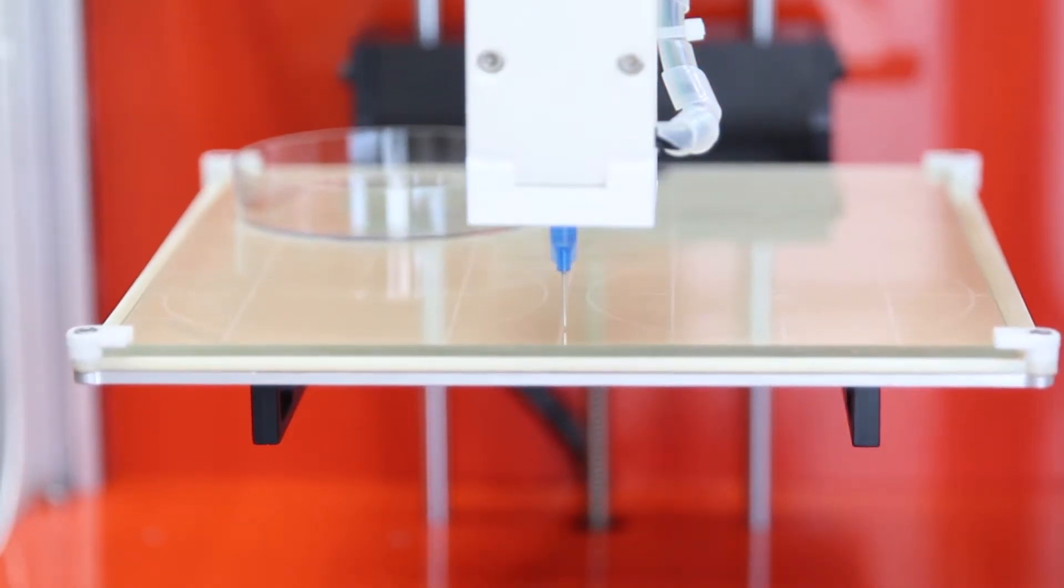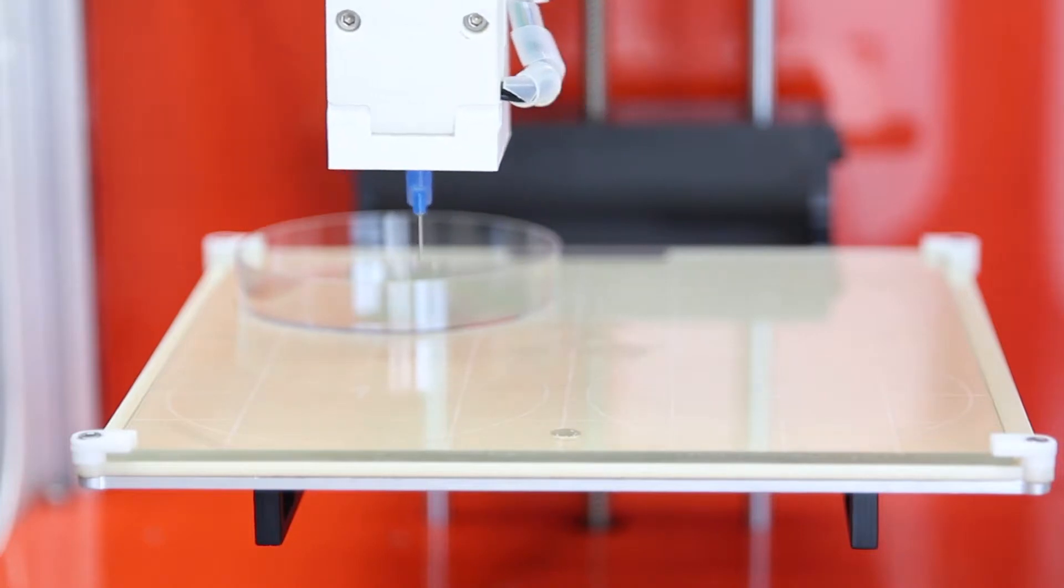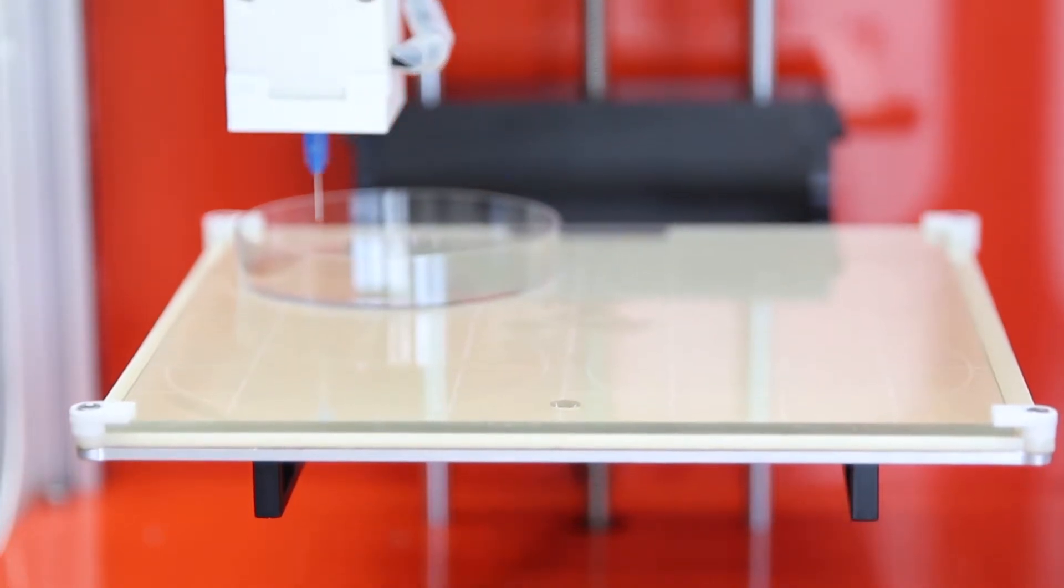The print will start with a priming step to ensure you will extract any air bubbles from the syringe, and will then proceed to print a 3x3 array.